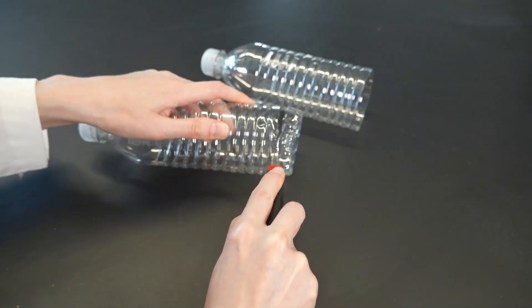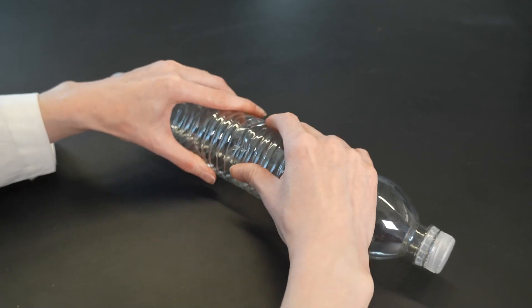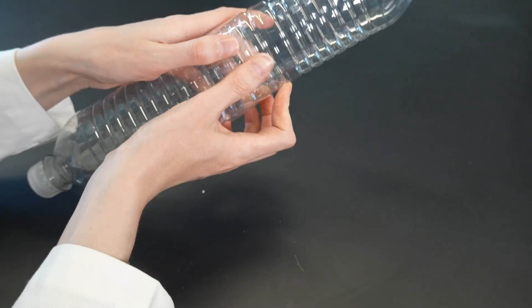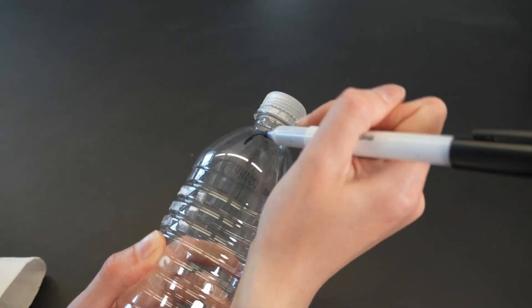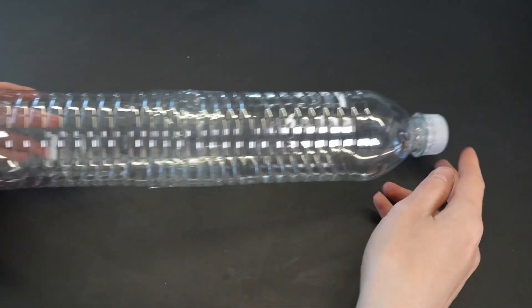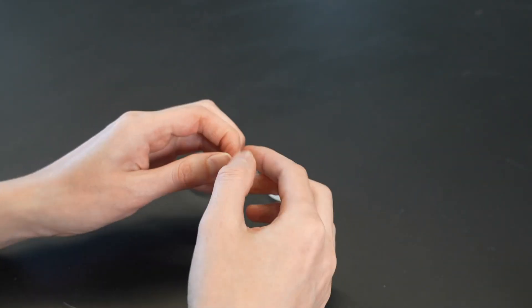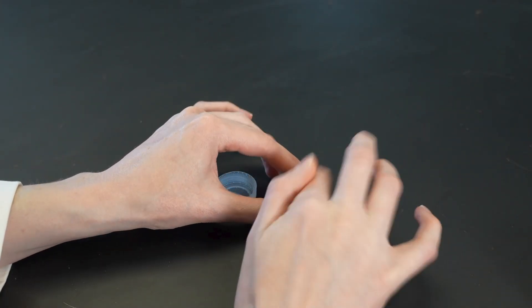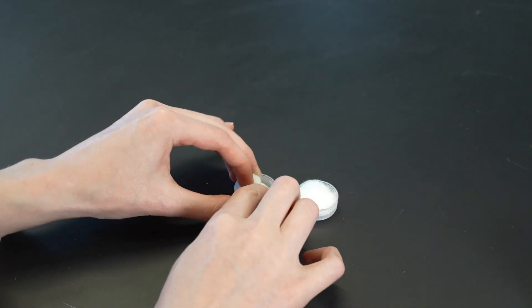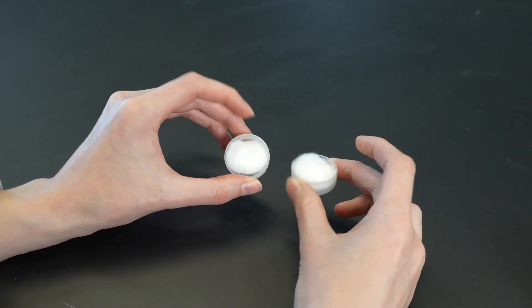First I'll cut the bottoms off my water bottles. Then I'll tape the bottles together with their cutoff bottoms facing each other and the caps at opposite ends. I'll label one bottle A and the other bottle B with my permanent marker. Next I'll make a little loop out of scotch tape and stick it inside one cap, and do the same on the other cap. I'll press my cotton balls into the caps so that they stick to the tape. Now I'm ready to add my stimuli.